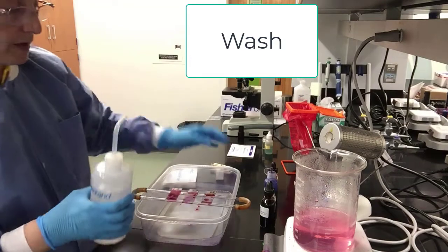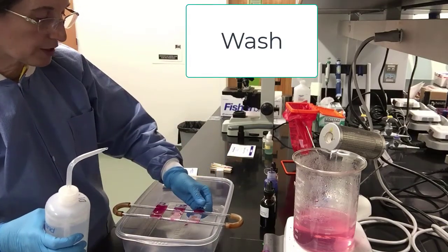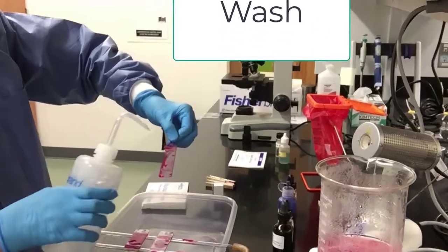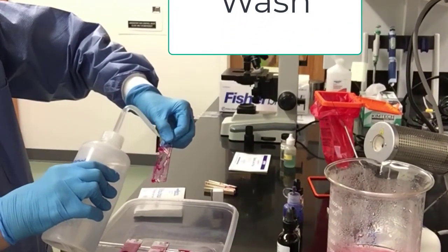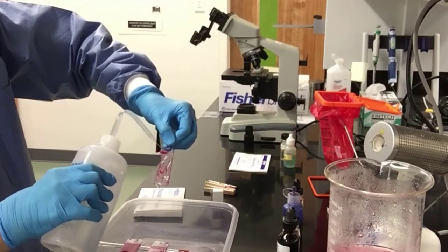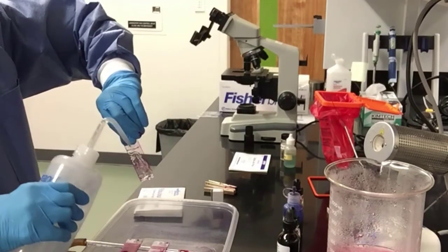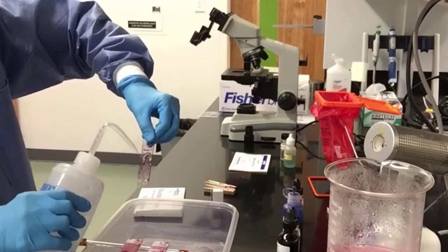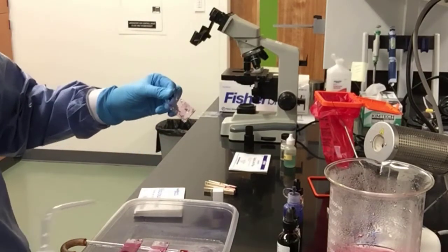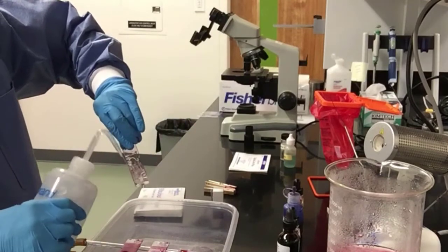Now remember, we always pick up the slide from the side of the label and we cover the label with our finger so we don't wash out the label. We spray the water carefully, let it run down the slide, and try to wash as best as we can all that stain off, and sometimes on the back of the slide as well. So this slide looks pretty good. We still have the specimen on there. We haven't lost anything, so that's good news.